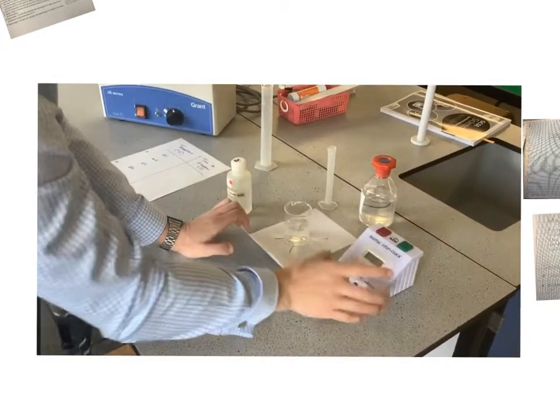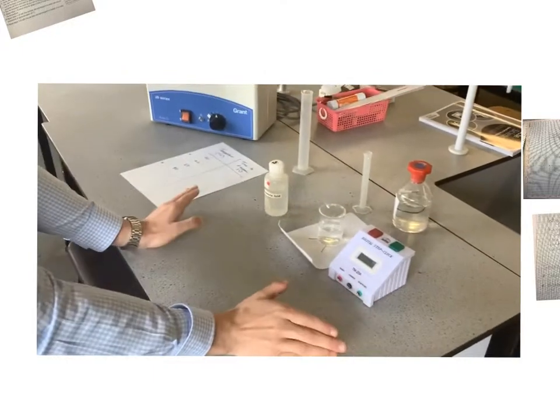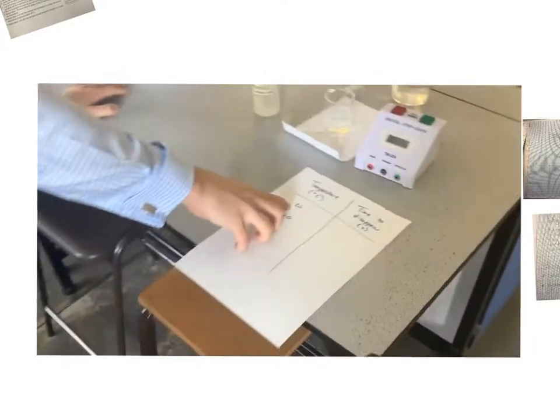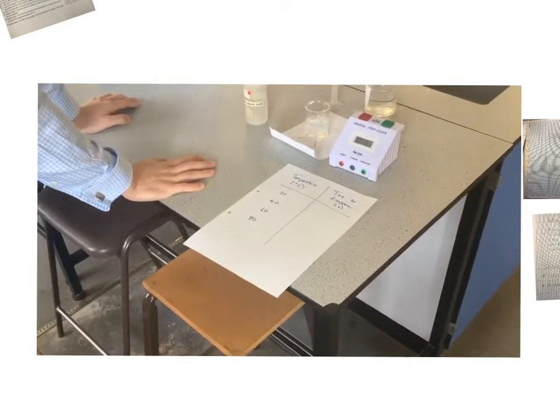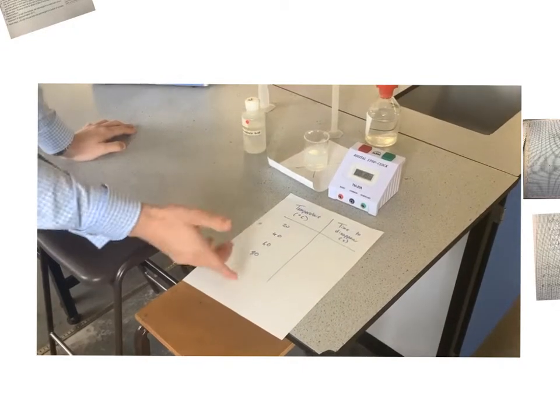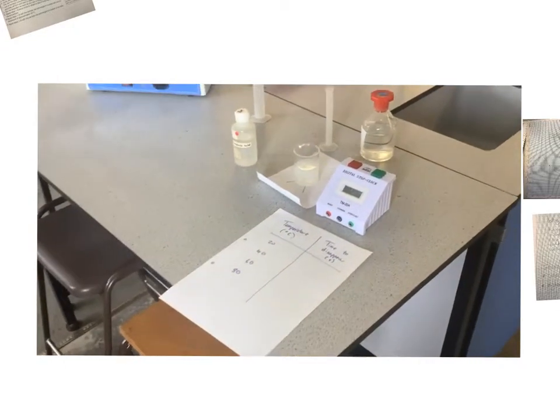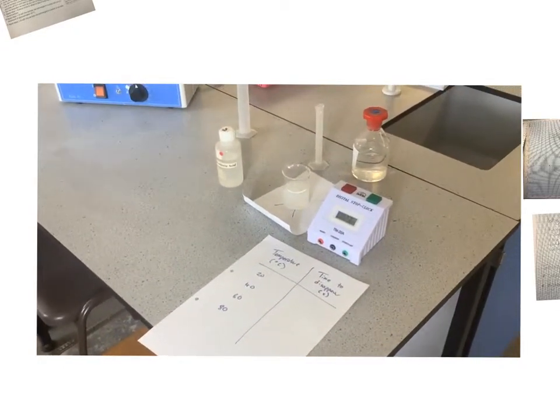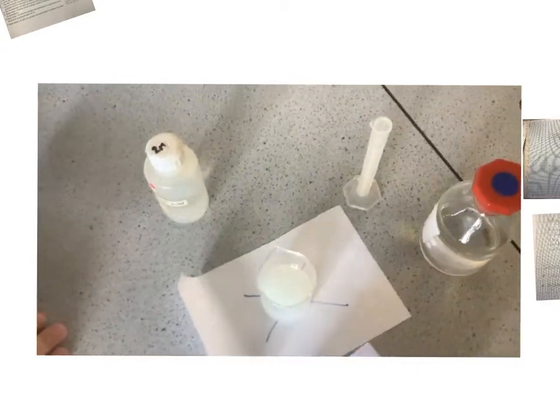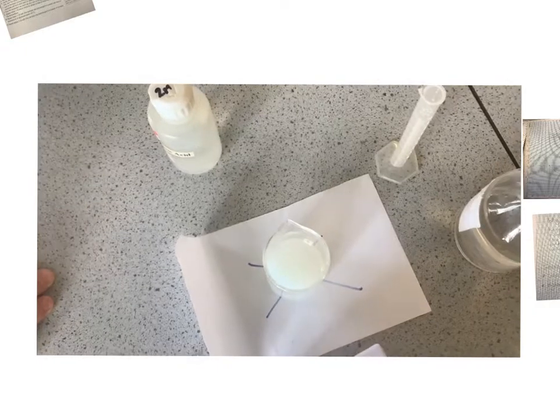Okay, so just while that's going on now, I've got the stop clock running. I'll just run you through what we would do next. I'm doing room temperature at the bottom, and then going to repeat at 40, 60 and 80. Obviously I can't go much higher than that because it's a solution, so it'll begin to boil. And we can actually see the colour beginning to change.